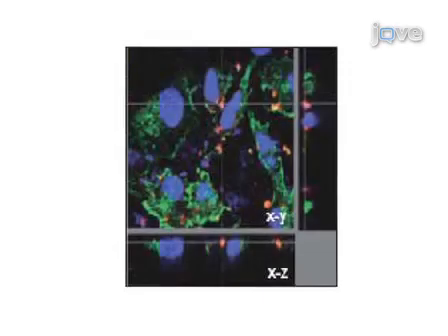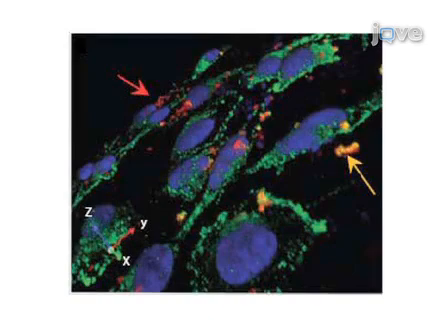In this next image, optical dissection of an infected HbMEC monolayer indicates co-localization around intracellular bacteria located at the base of a cell. When three-dimensional images of infected HbMEC monolayers were processed, an oblique view of the apical surface shows adherent bacteria stained red, indicated by the red arrow, whereas several bacteria located towards the basal surfaces of endothelial cells, indicated by the yellow arrow, are distinctly orange-yellow in colour. Basal location can be more clearly seen in this end-on XZ cross-section.